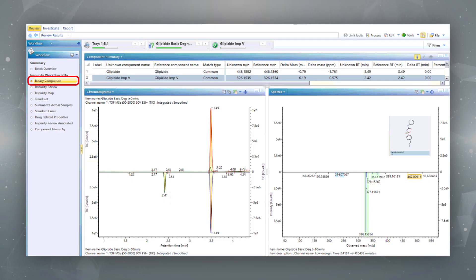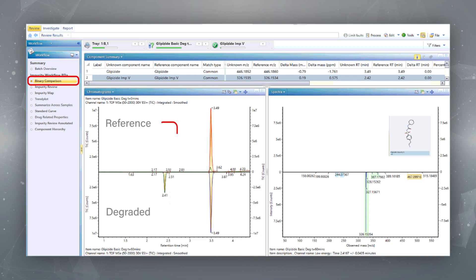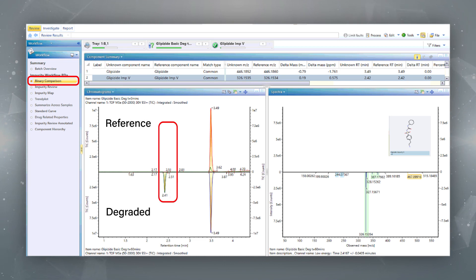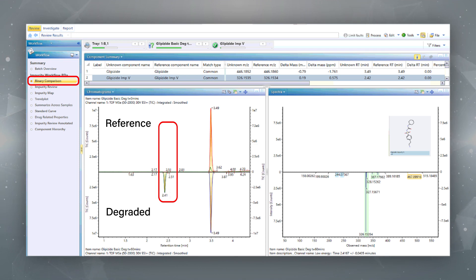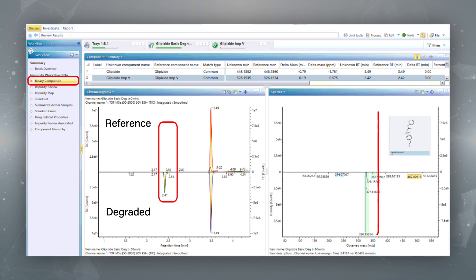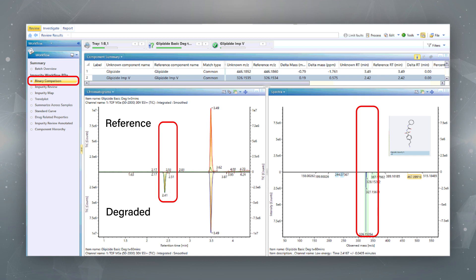The binary compare workflow step can be used for an initial appraisal of the incubated compound. This involves selecting a reference sample — in this case the t equals zero minutes degradation — and a degraded sample incubated for 60 minutes at 80 degrees centigrade are compared. We can clearly see a peak at 2.41 minutes present in the degraded sample only. The mass spectra is displayed and UniFi has automatically identified the degradant as impurity 5 and visualized the structure.